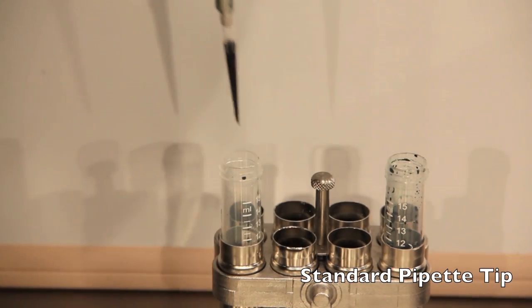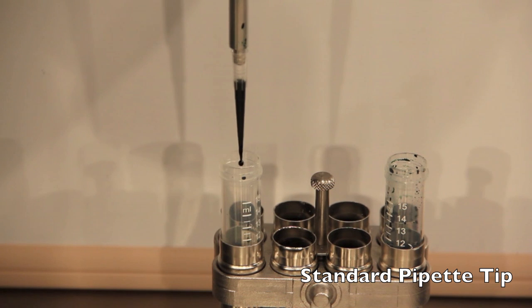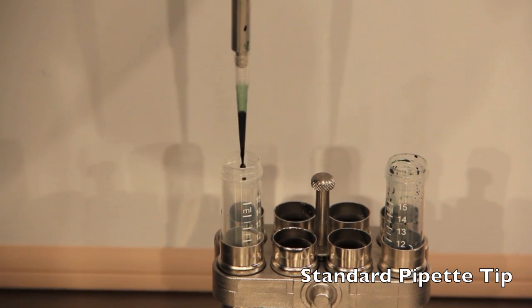Now we'll be doing the same experiment with a standard pipette tip. As you can see, the retention on the tip is very noticeable.